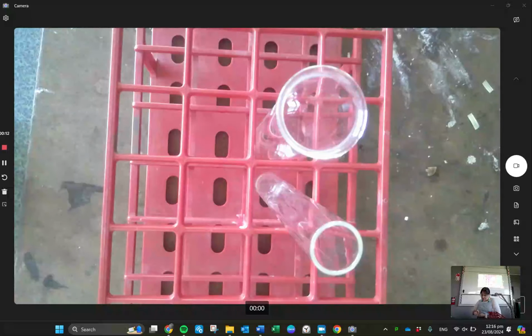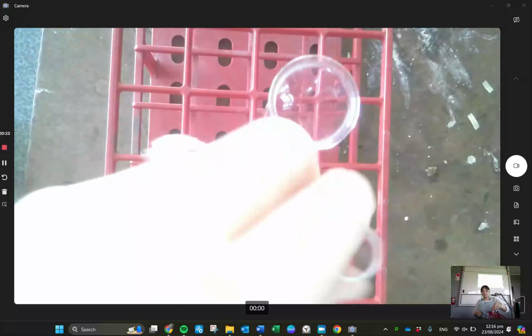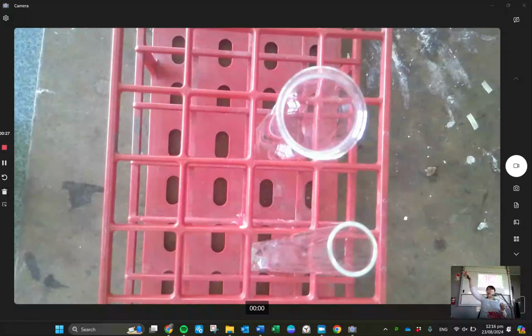So we have our first chemical reaction. This is actually 2 chemical reactions here. So that's why I gave you guys 2 write-up sheets. The first reaction, we are using magnesium in a test tube, like that. And the second reagent is going to be the sulfuric acid.